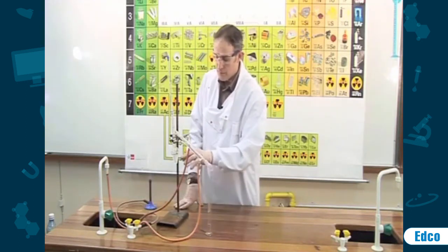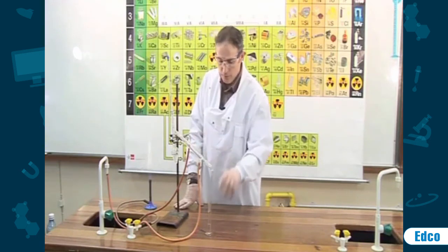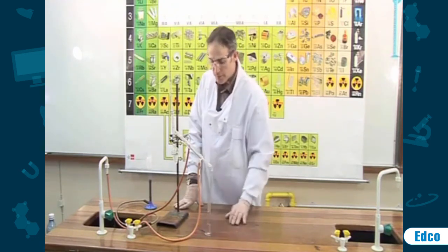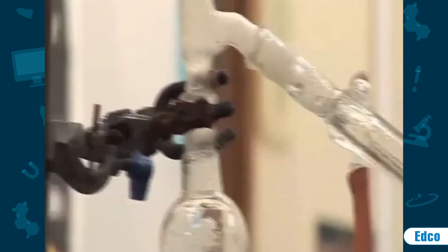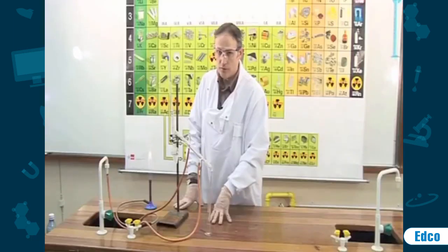All the alcohol has now boiled and has travelled over into the graduated cylinder. The liquid that travels over is known as the distillate — in this case, alcohol. The liquid which remains behind — in this case, water — is known as the residue.